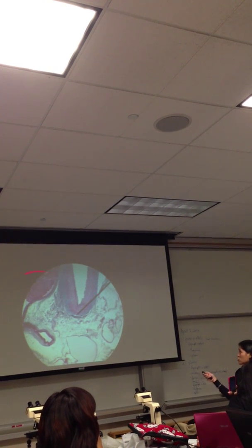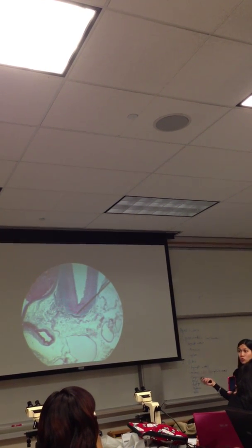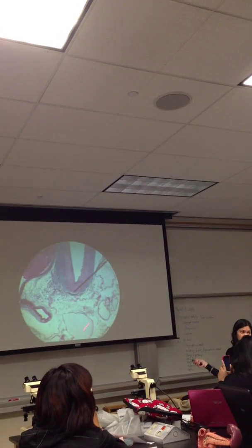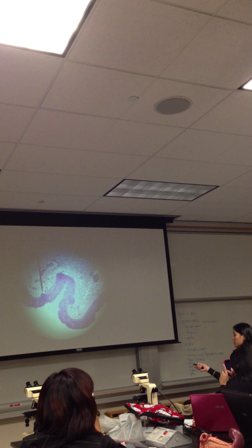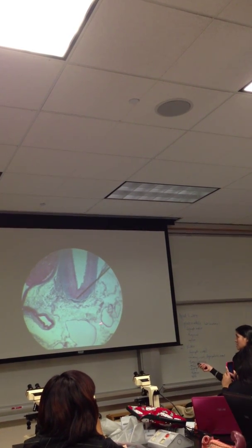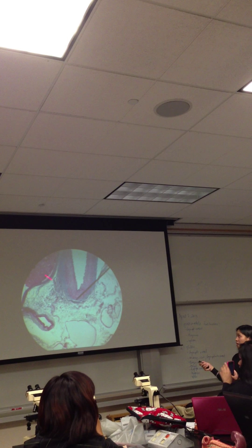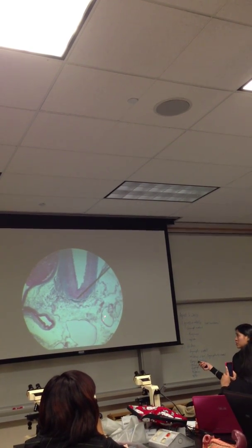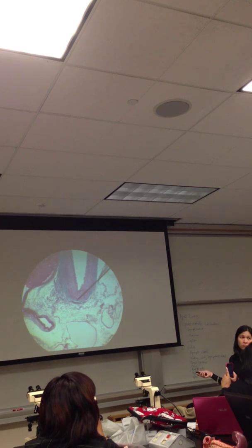That's a really good picture also, and it captures all three, so you can distinguish which one is which. You already know two out of them, so that's why it was easy for you to identify which one. And if you notice, you don't really see any cells inside, do you? Right? And like here, you see the blood, and then here it's pretty clear because that's pretty much fluid in there.